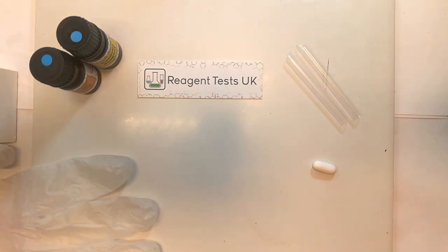You'll need of course a substance to test. The reagent tests themselves don't contain any drugs and are just legal chemicals. Given that the tests are highly reactive and the whole point is to cause a fast colour change, they will react with other things as well.